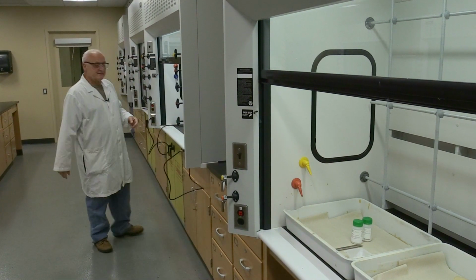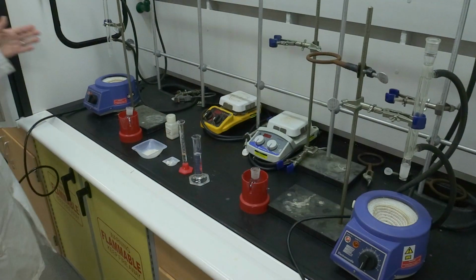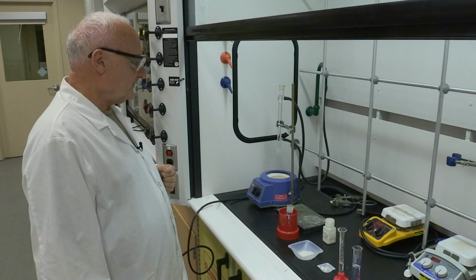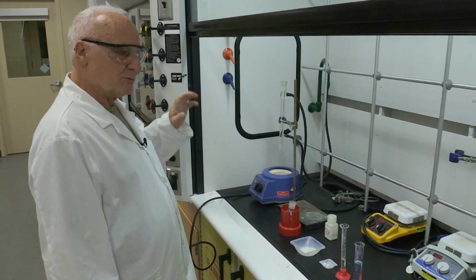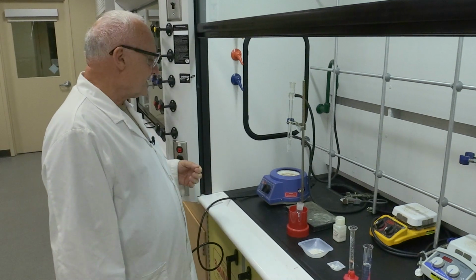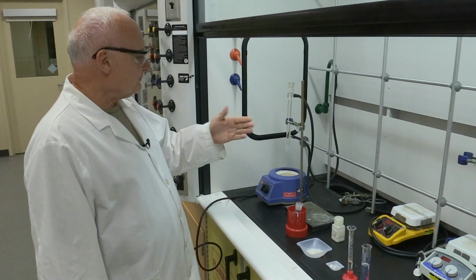This is part A of the experiment. So we're using a larger apparatus for reflux compared to what we used previously. We have greater quantities of chemicals, but it's the same principle.